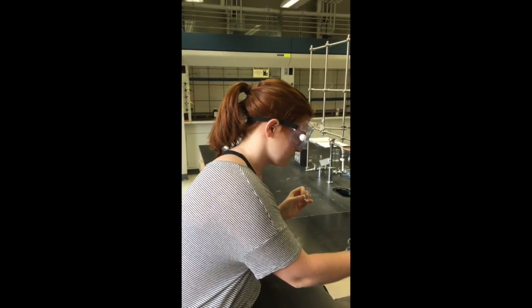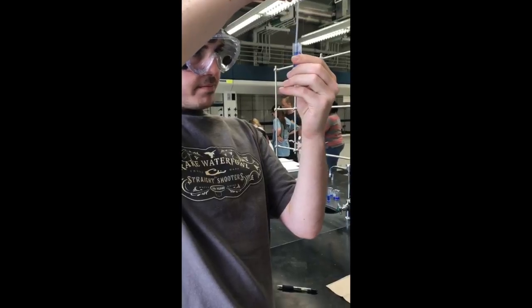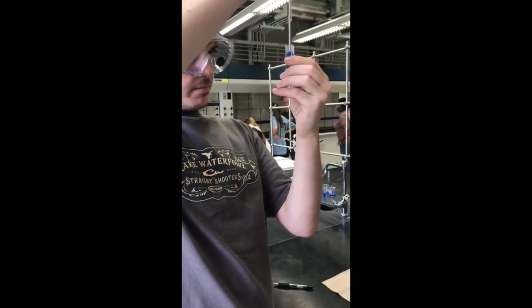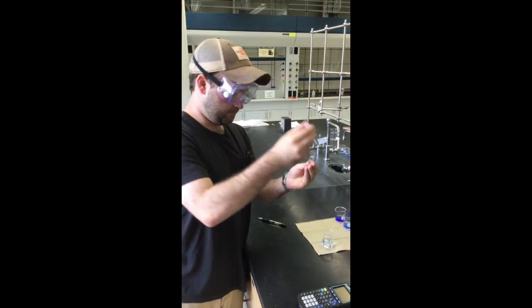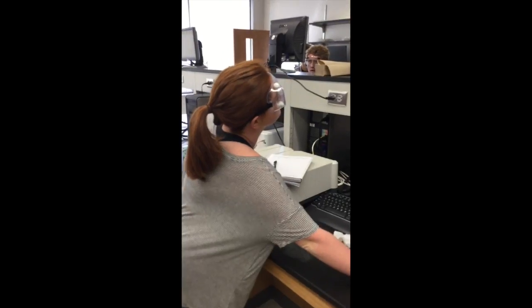The first step in preparing to use the spectrophotometer is to load our samples into cuvettes. Each dilution was added into a cuvette to the fill line. We also prepared a blank to use later.